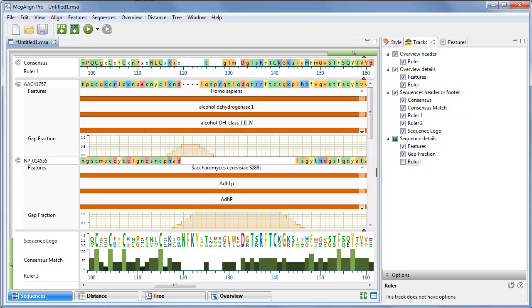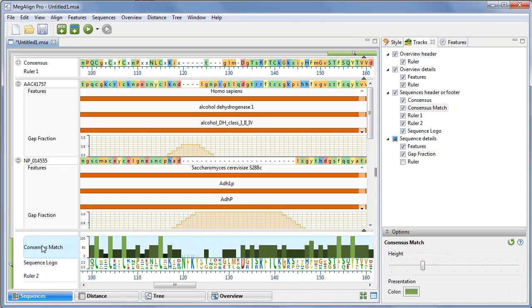To change the order of the tracks, you can drag a track label to the desired position among the other tracks and drop it there.